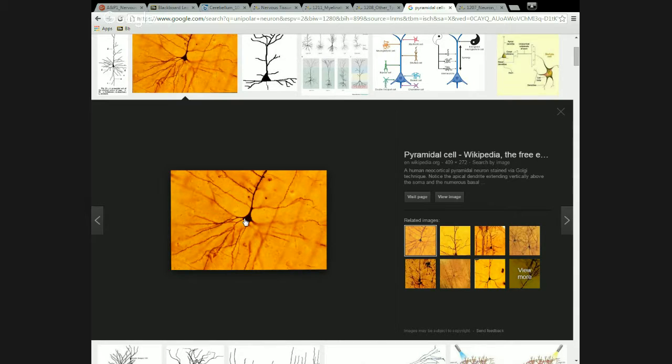And it's also much more chemically safe, and people using this don't go crazy so much. But it's called a pyramidal cell because the cell body is shaped like a pyramid or a triangle or a cone, or whatever you want to say. With the pyramidal cell, there's one dendrite that goes straight up from the peak of the pyramid. And then along the base of the pyramid, there's a bunch of other dendrites extending out away from it.